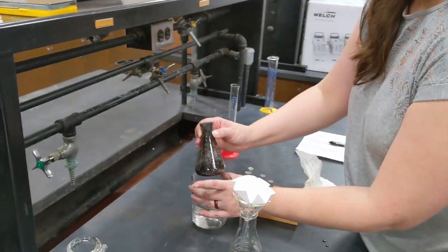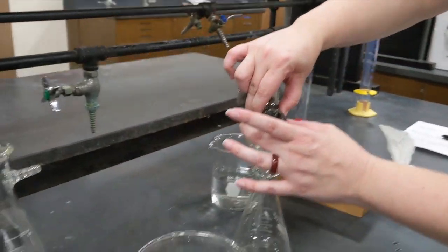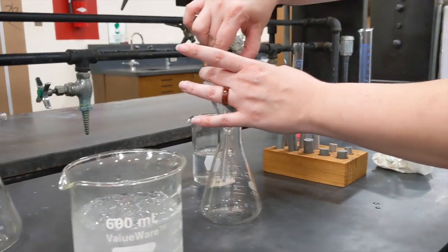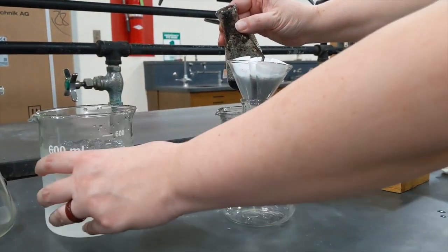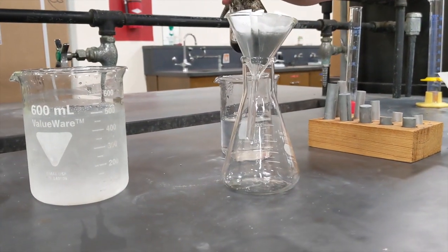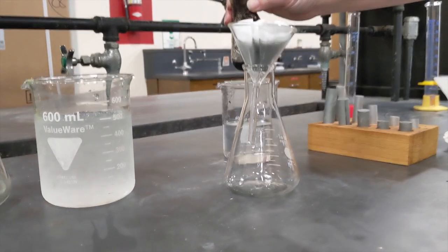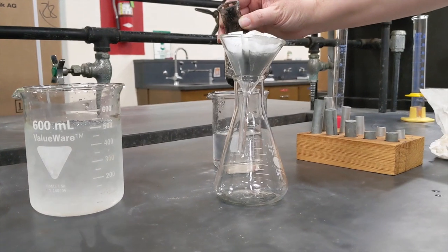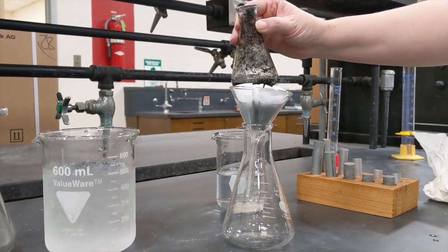So the first thing I'm going to do is gravity filter this. Gravity filtration means what it sounds like it means, using gravity to pull the solution through the filter paper. The thing that I want here is in the liquid. I'm getting rid of the impurities that are the solid dissolved in it.